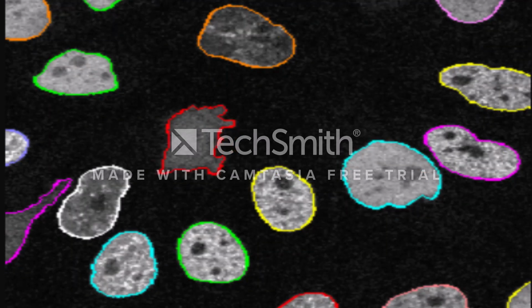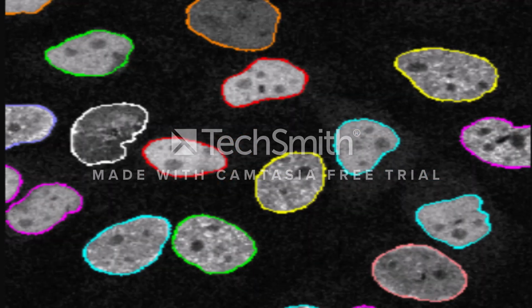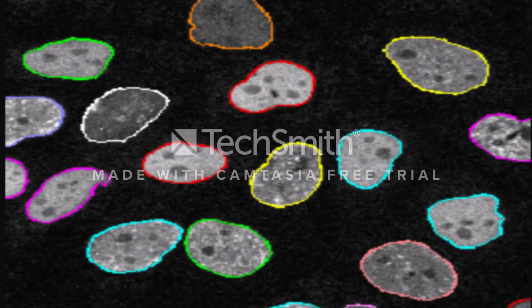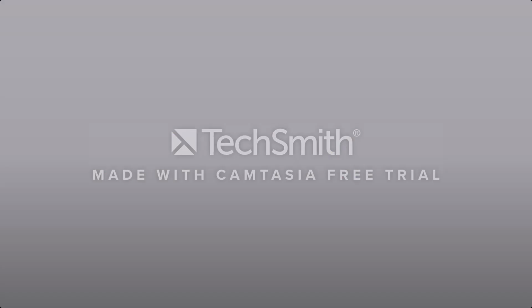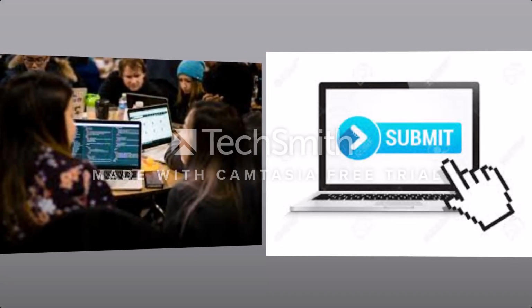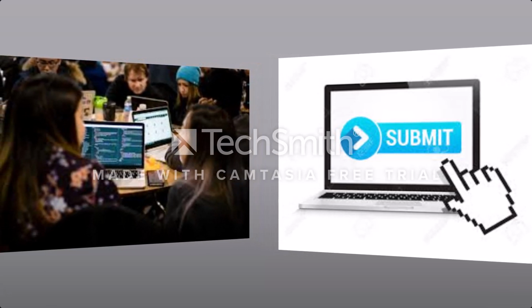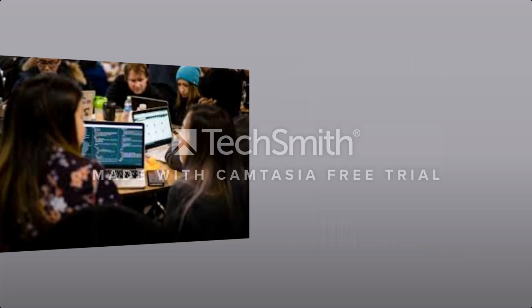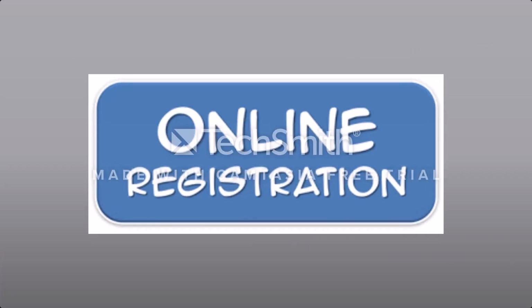In the year 2012, a cell tracking challenge was launched by a steering committee of members around the world, with the aim of encouraging the development of robust cell segmentation and tracking algorithms. Initially, 6 fixed deadline challenge editions were organized as a part of an in-person event. Later on, online submissions were welcomed. To compete in this challenge, the participants need to register online on this website, and only then are they allowed to submit their results online.